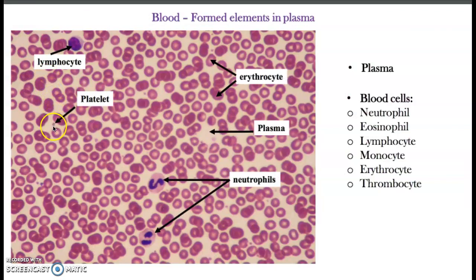These small fragments visible in the slide are not whole cells — they are fragments of cells. They are irregularly shaped cytoplasmic fragments of a large cell called the megakaryocyte. They are important to initiate hemostasis, the stoppage of bleeding. During hemostasis, platelets form platelet plugs and are the precursors for the blood clotting cascade. They are occasionally referred to as thrombocytes, and they are very important for blood clotting. Their lifespan is almost 10 days.